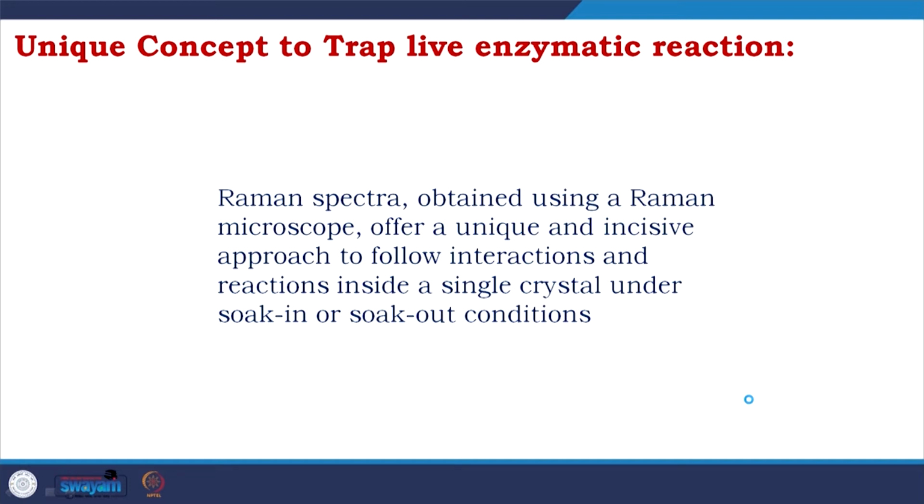First, understand the concept. You have a crystal. The crystal offers a 3D environment, right. Now, you have a setup of confocal microscope, where you could scan the Z axis.